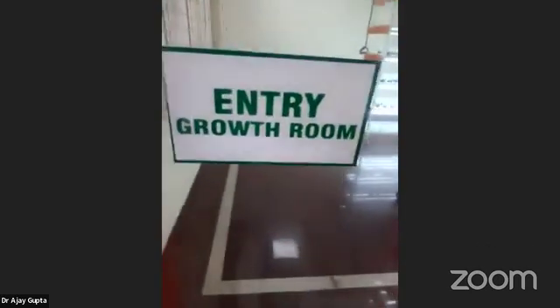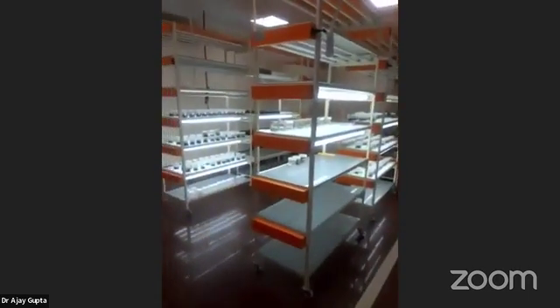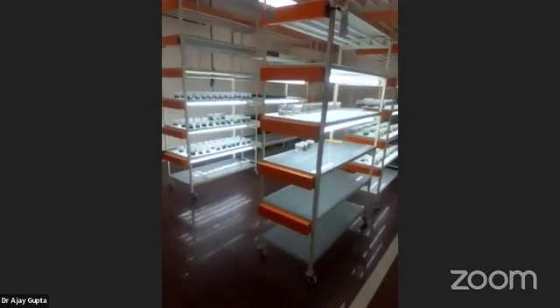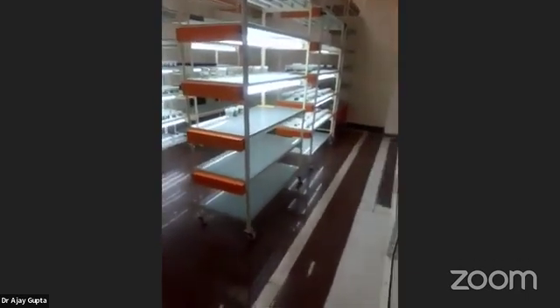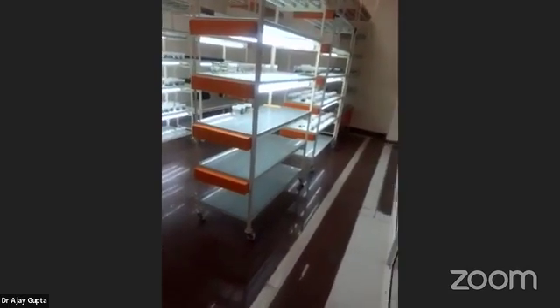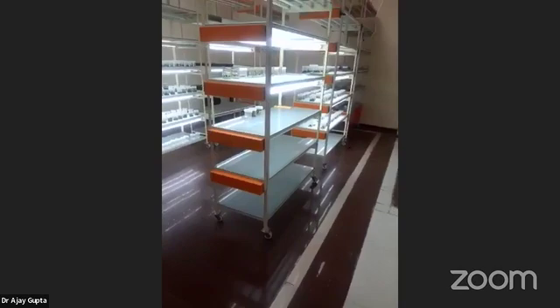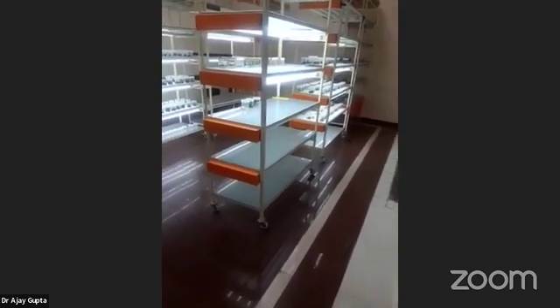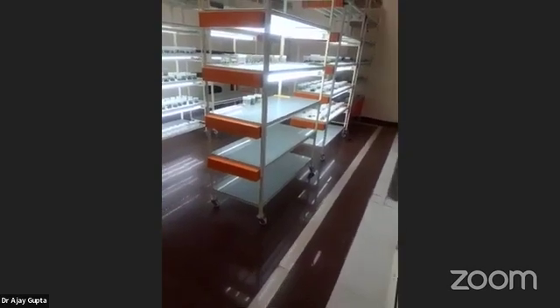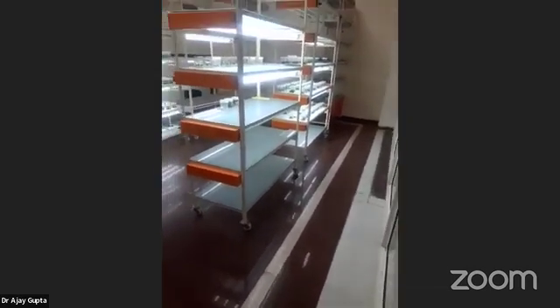So this is a growth room, and here the cultures are kept. Here the multiplication goes on, and depending on the time period, these plants are grown. Here we do the shoot culture, and then, as I explained, we have to transfer to another media where the rooting is done. Then the plant's shoot and root are ready, and after that they are transferred to the tray.